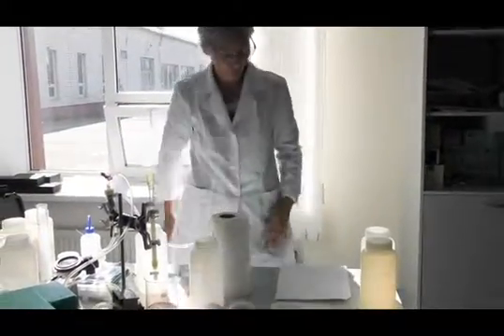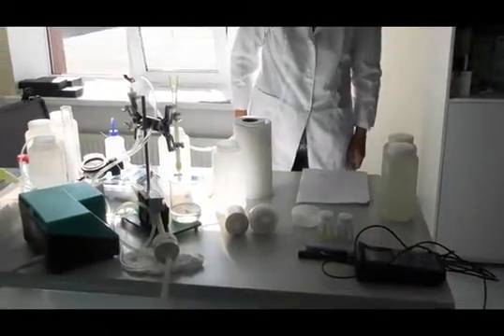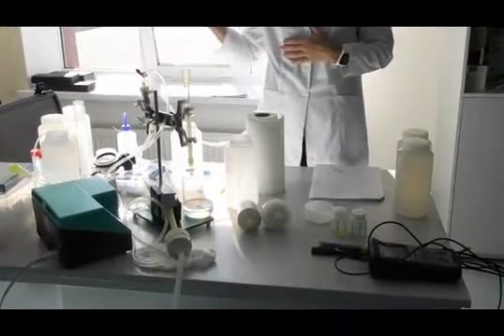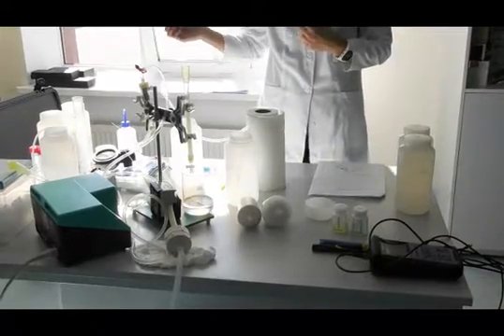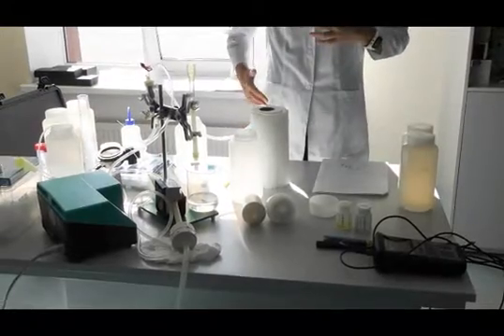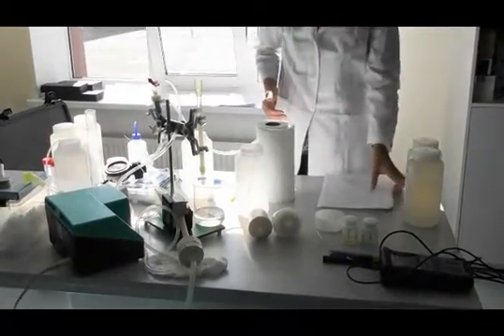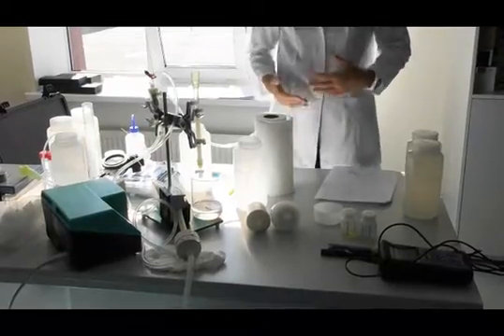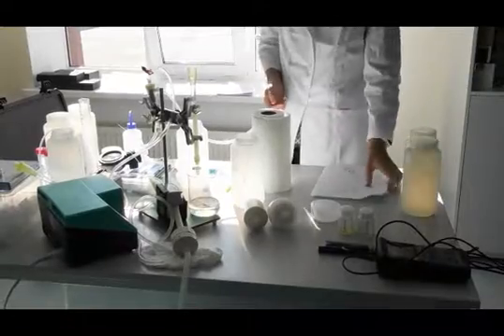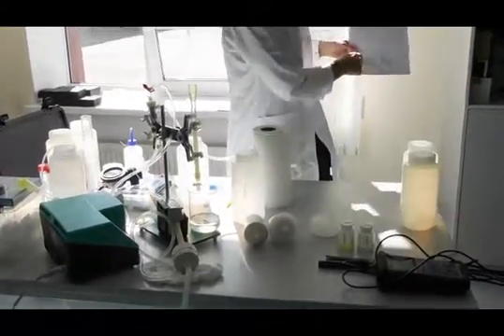That was 0.45 micrometer filtration, but then we pressure the whole sample through, and what's coming out on the other end of the membrane will be the smaller than 0.45 micrometer fraction. To split between the high molecular mass fraction and the low molecular mass fraction, we use an ultrafilter. You see the setup here. It's actually a figure of this one here.